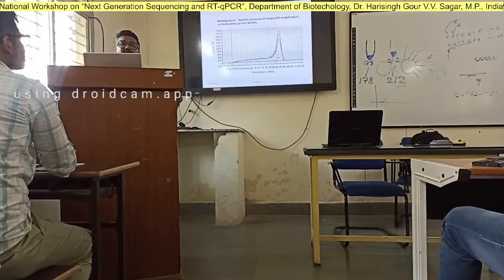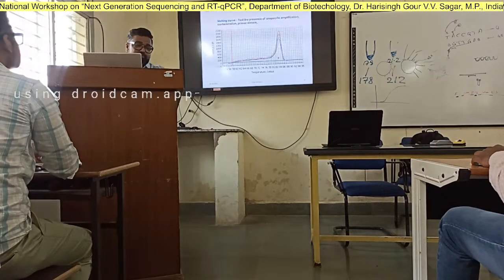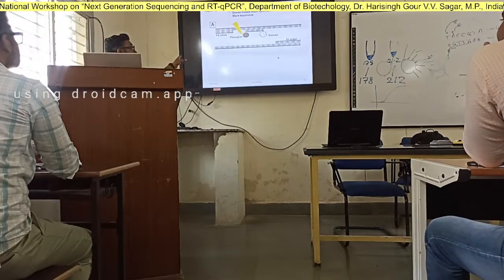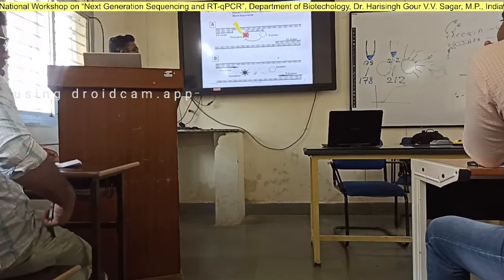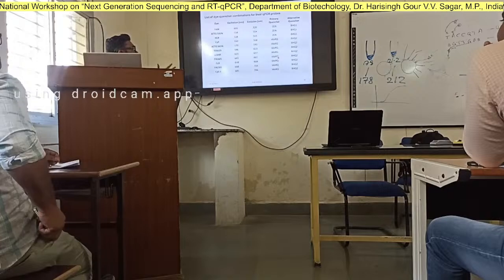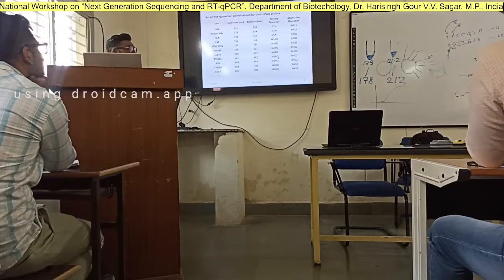This is very important. Suppose you are working on gene expression pattern and for TaqMan, as I told you, just go through it. So there is a probe, there is a fluorophore and quencher. Usually fluorophore and quencher are very close to each other, so there is no signal. Once the fluorophore and quencher are broken apart, you have signal. There are multiple kinds of dyes that do this. Melting analysis was primarily for SYBR Green.